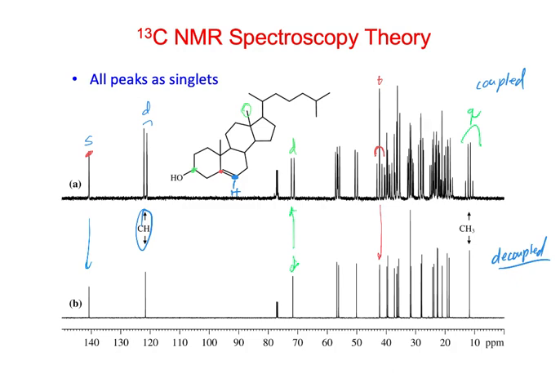All right, so the coupled spectrum, the coupling that we see most easily is the one bond coupling. Okay, so this is J1. So it shows how many protons are attached. Does it do any, I always forget the word, the symmetry, but not because of the magnetism?